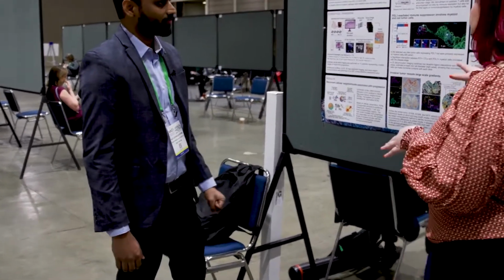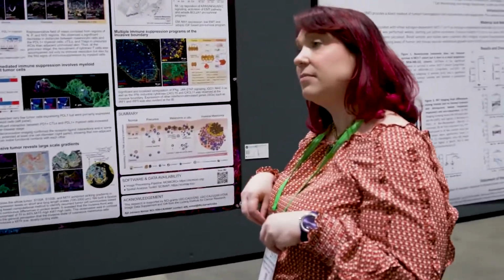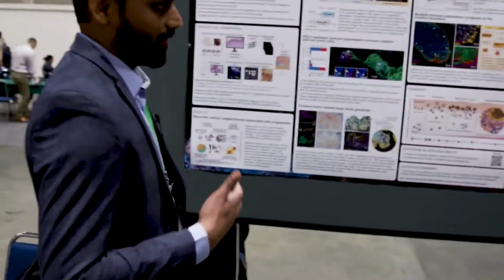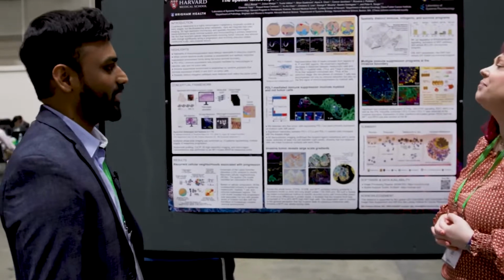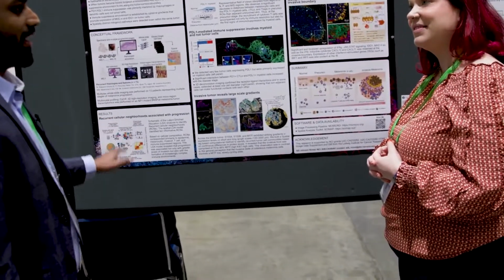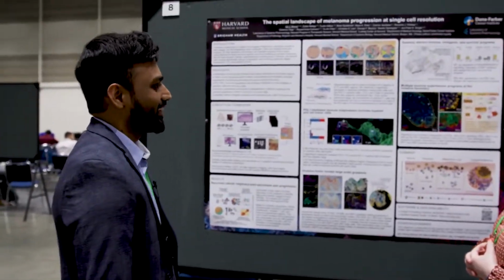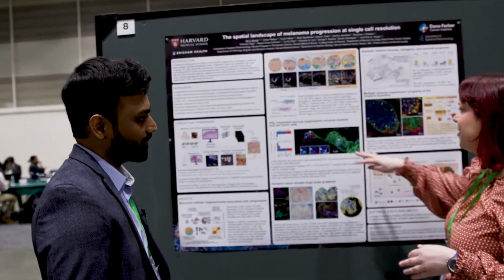Yeah. And for the GeoMx data, did you do whole transcriptome? No, this was using the CTA. We regularly do WTA now. WTA now, but this was I think 2-3 years back when we had early access to the CTA program. Yeah, yeah. And tell us a little bit more about the 3D imaging.